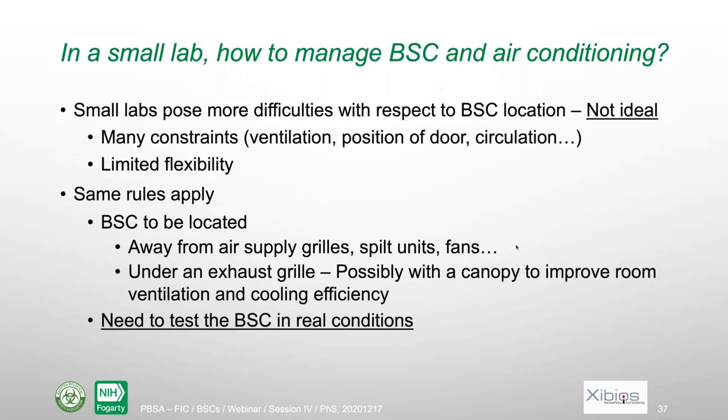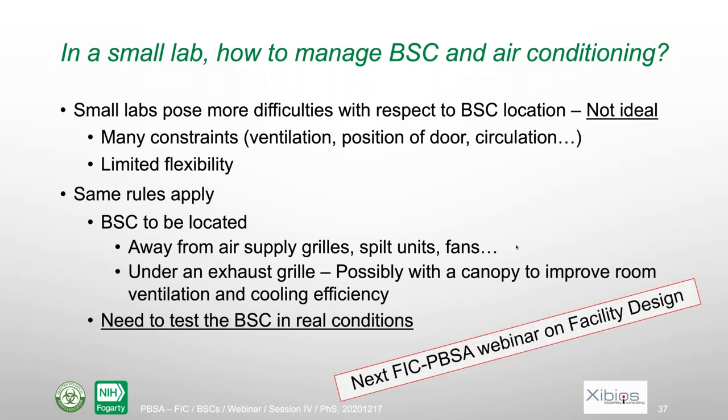In a small lab, how to manage biosafety cabinets and air conditioning? Actually, it's true that small labs are not ideal for biosafety cabinets because there are many constraints with respect to ventilation, position of the doors, and so on, and also limited flexibility. But the same rules apply. And again, you need to test the biosafety cabinet in real conditions. And I remind you, the next webinar should be on facility design.